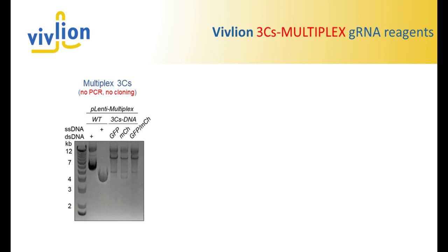What we did here is we took roughly 120 oligonucleotides or gRNAs for GFP and roughly 120 for mCherry. By doing so, we generate 14,000 or 16,000 combinations by simply mixing those two primer pools now into a single tube with single-stranded DNA instead of single pools. And then you wait 2 hours, and then this is basically the reaction product that you see on a gel. Again, I would like to stress that we don't do any PCR or cloning here.